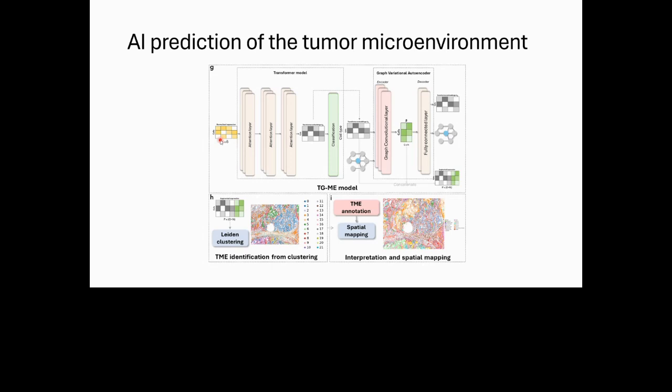The intention to use this in the pipeline is to be able to look at the context. There is a context that we can find with a transformer, the context for each cell. If we look at one cell and think what is around that cell, then we can use the transformer, a deep learning model used a lot in natural language processing, because it's able to look not just at the other cells close to the cell of interest, but it can look farther away compared to other models. And then we use a graph variational autoencoder, because of the nature of the problem, this can also be looked at as a graph algorithm. That's what Carla is going to be describing in the next slides, and then showing you the code of how we did this. Go ahead, Carla.